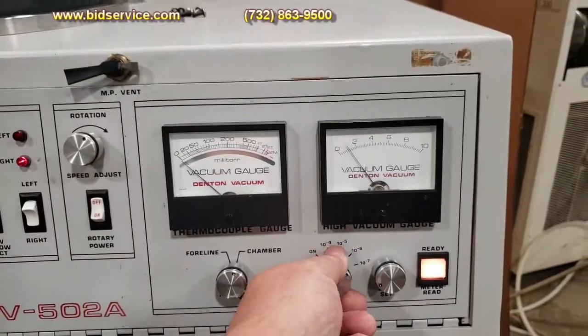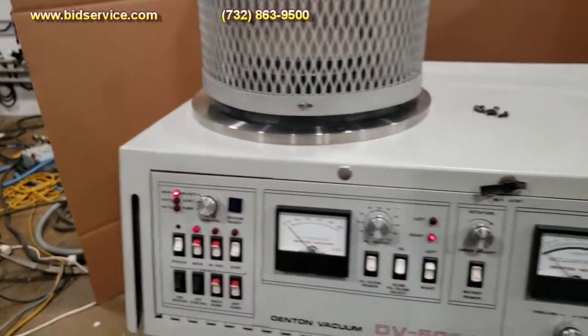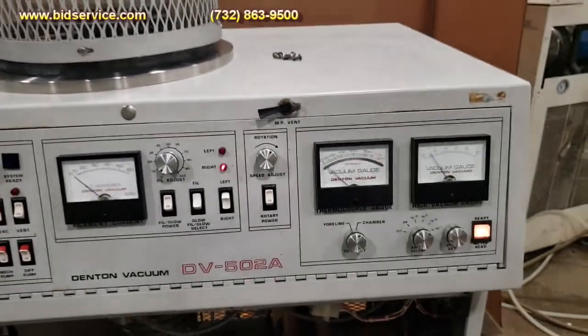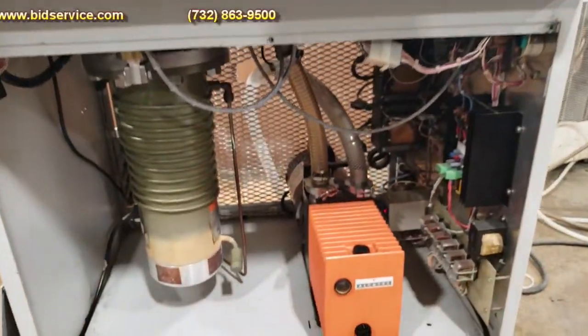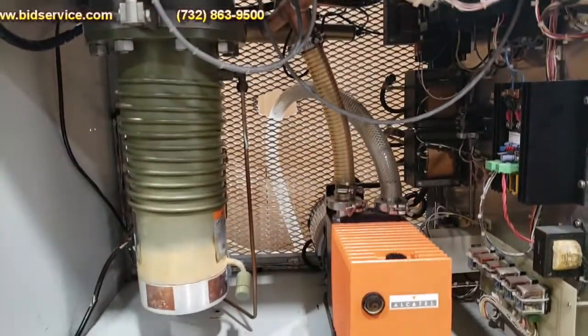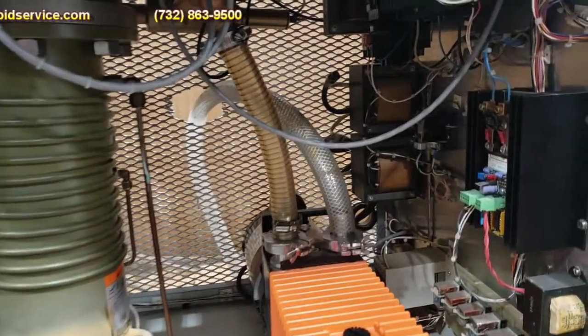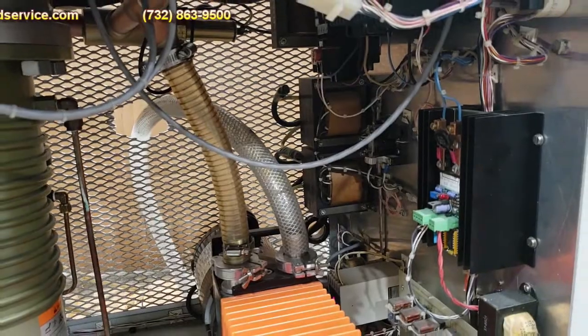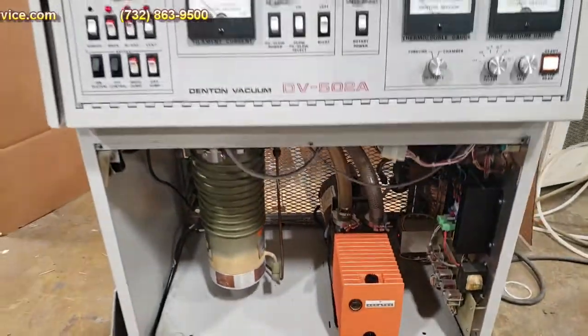As you can see, if you go to seven, it's out. And down below is everything between your pump, your diffusion pump, and your control panel with your contactors and your power distribution for the filament.